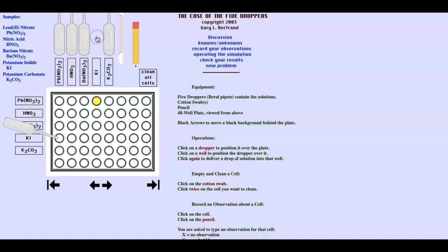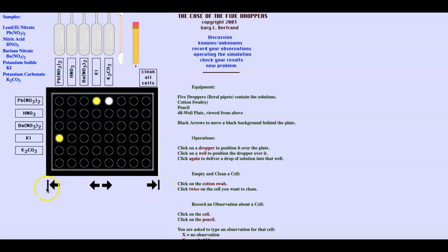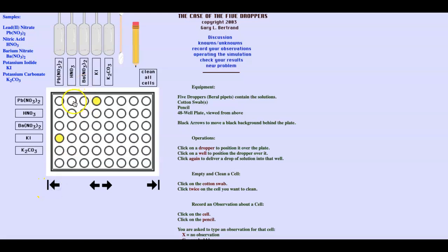The other compound I like is potassium iodide. There we go. Now, we've still got that same yellow precipitate, so that's a good check for us. And so going straight across, I would add this. And I don't think I have any other precipitates forming, but the way for me to check that is to pull that up. The other thing, and I think, so let me get some, this is HNO3, hydrogen nitrate, also known as nitric acid. We'll study those later in the semester.